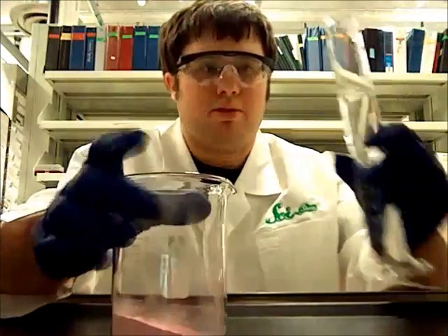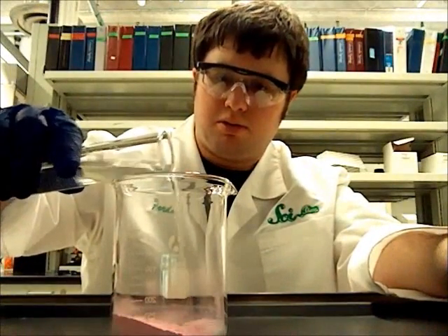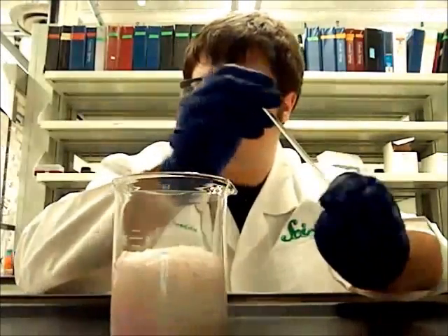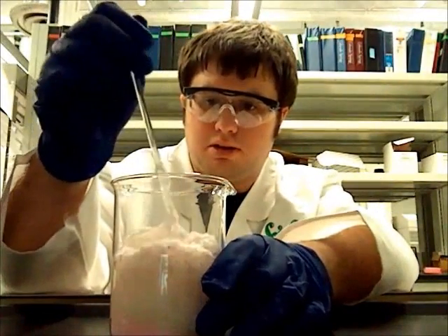The remainder of this experiment was performed under a fume hood for safety. I added 100 ml of 6-molar hydrochloric acid, a little bit at a time. After adding a little bit, I would stir, and then I would stop periodically to let some of the foam die down.